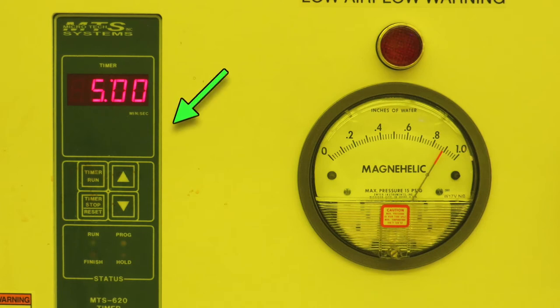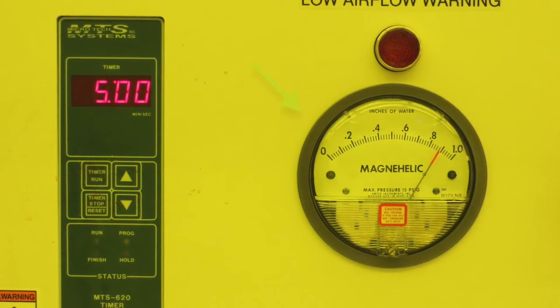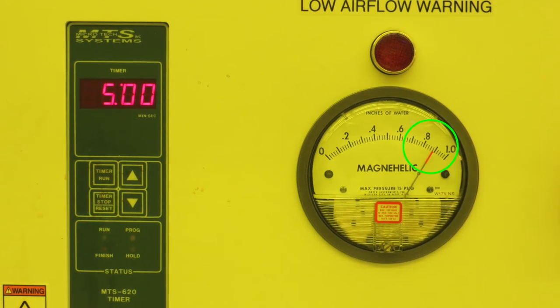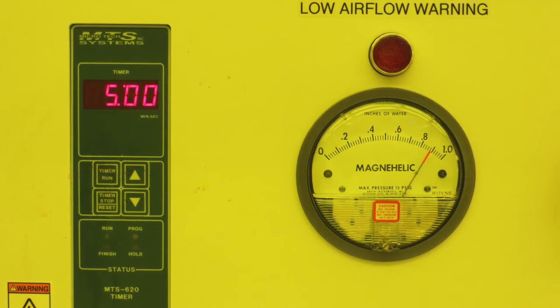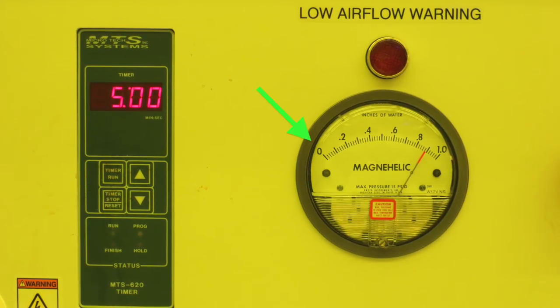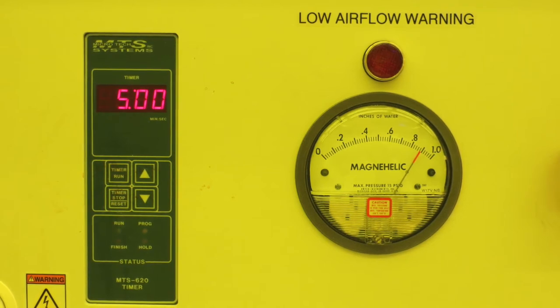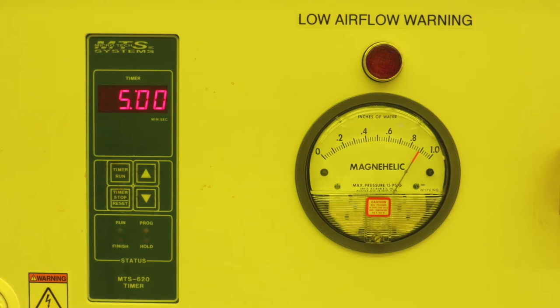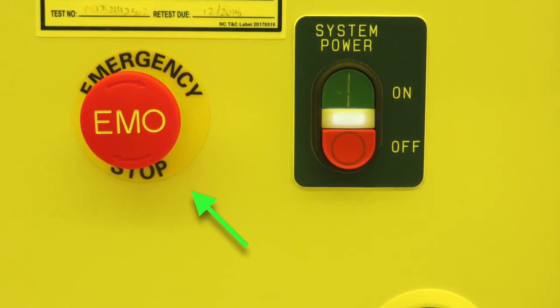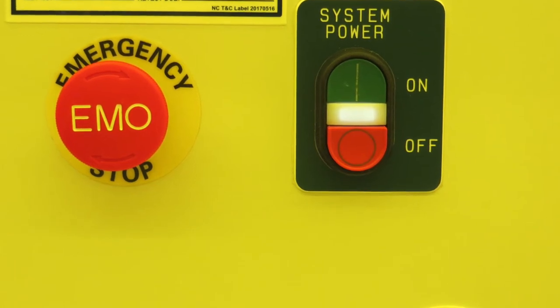There are several general use timers above each wet bench used for timing etches or for timing developer in the base bench. There are also these magnehelic gauges which are used as a way of confirming that there is proper airflow through the bench. Normally they should read between 0.7 and 1. Every once in a while the building's fire sensors erroneously sense smoke in the exhaust ductwork. If this happens, dampers in the exhaust system fully close which causes the flow to drop to zero. So I installed these alarms and bright red warning lamps in each bench to warn users of the dangerous loss of airflow. If this happens you should leave the lab immediately while we wait for the HVAC guys to reset the computer which handles the exhaust extraction system. There is a large red kill switch up at the upper right corner of each wet bench. If you have some kind of emergency in the bench you can just push this button and it will kill the power to the entire bench such as turning off hot plates or anything that you're worried about.